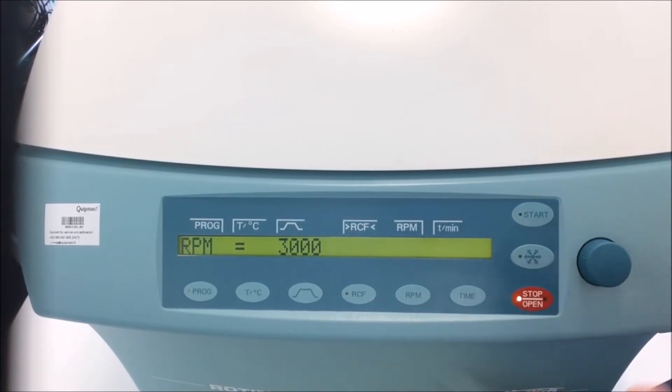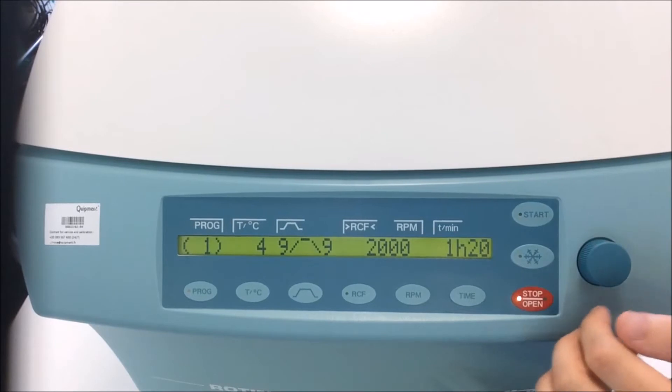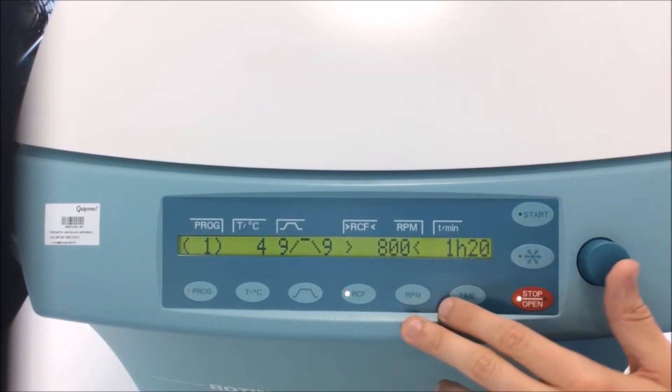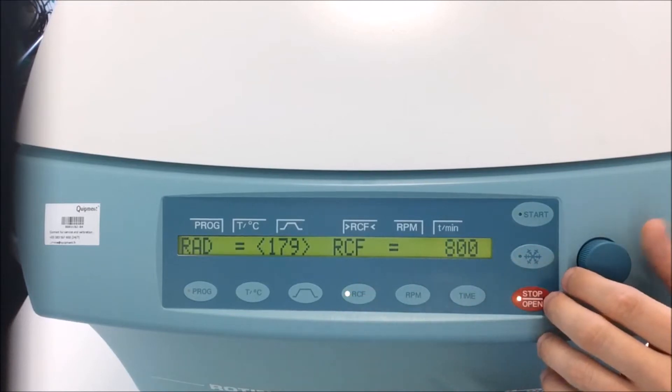I will decrease the speed, so let's say 2000 instead of 3000, which is in RCF 800. Of course, I can also modify the RCF. I don't want to do that.